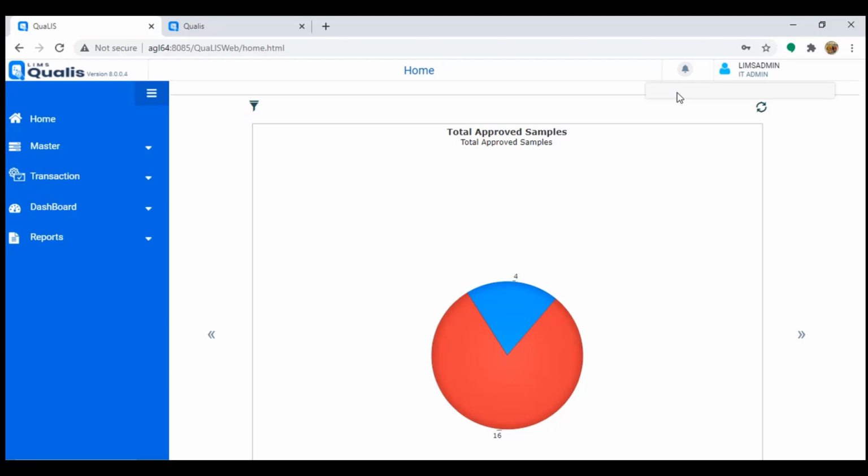So these are the helpful tools for users in LIMS. It's all about traceability and a proper workflow. So when I log in, I should be able to see what is happening. I should be able to see what is pending for me to do. So that is how we help laboratories with the traceability of activities. That's the main goal of laboratory.